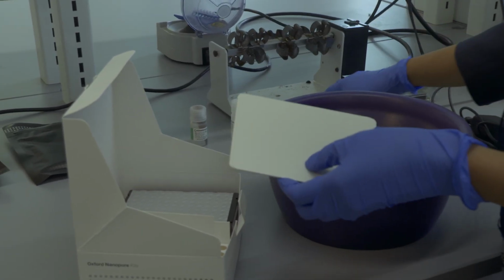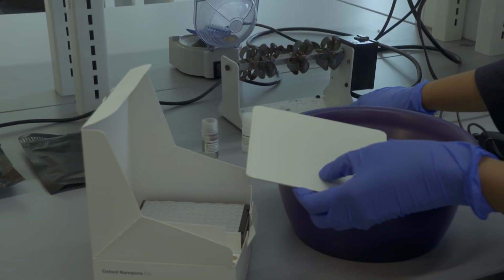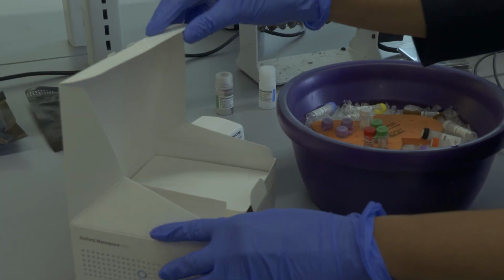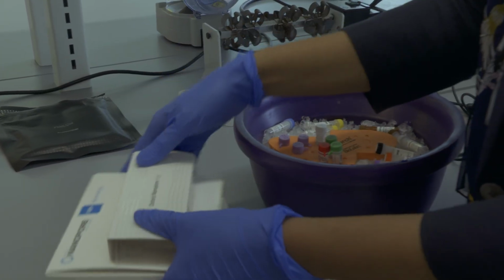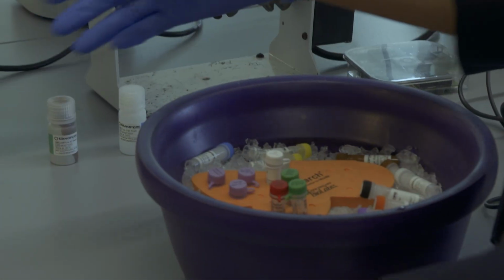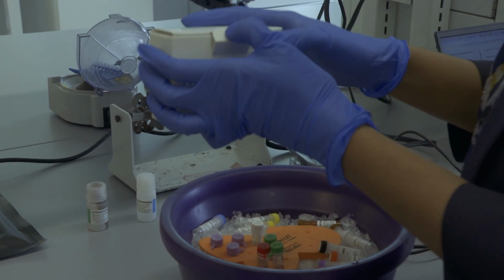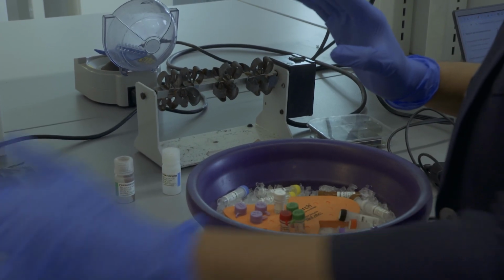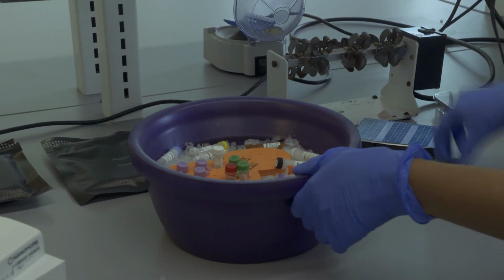And we took out one barcode plate. We don't need more than that. I think I have everything. So this, again, keep it at 4 degrees for now. Okay, and then how about this? I already took out 3. So everything, for now, let's keep it at 4 degrees, and then we can keep it at -20 later.